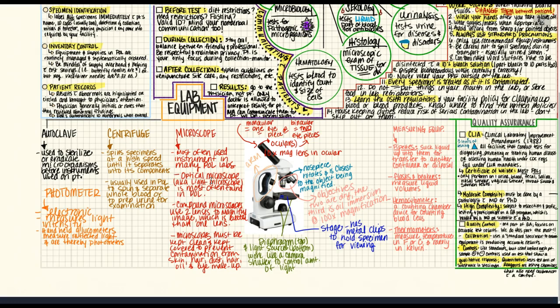Microscopes must be kept clean. And also, they should always be kept covered. Most microscopes come with a cover, and you should keep the cover on them when you're storing them to make sure that you keep all skin, hair, dust, eye makeup, oils, anything floating around in the air, away from the microscope, because they can contaminate the light source or the lenses and get trapped inside there, and then things look funny when you're looking through the oculars and trying to visualize what is on the stage.